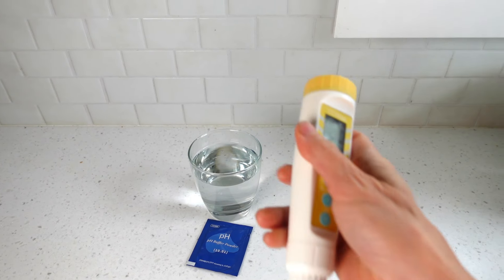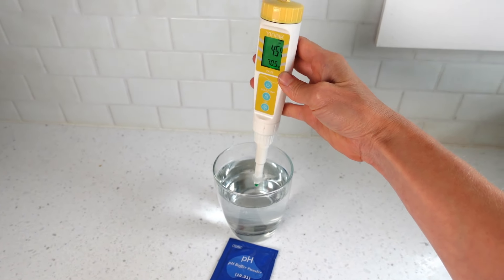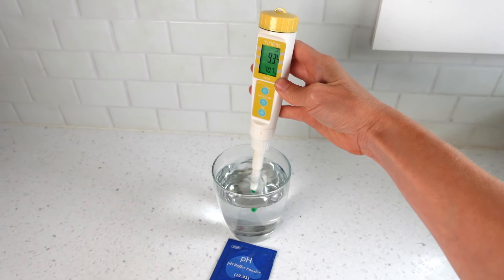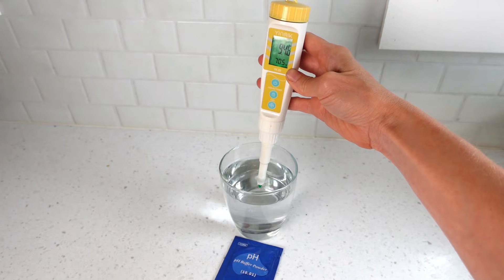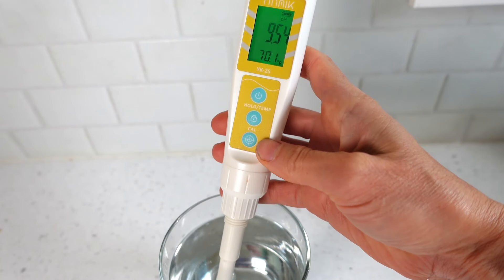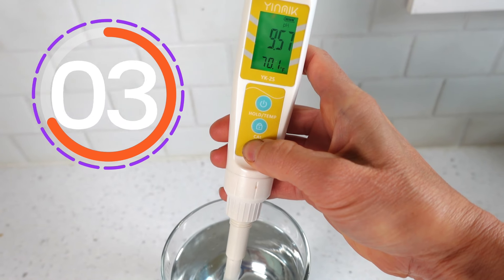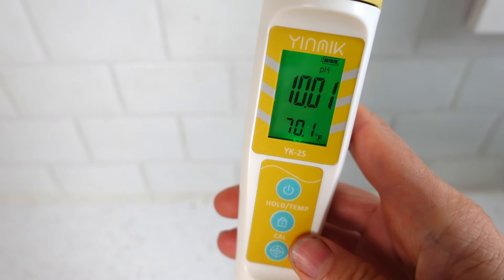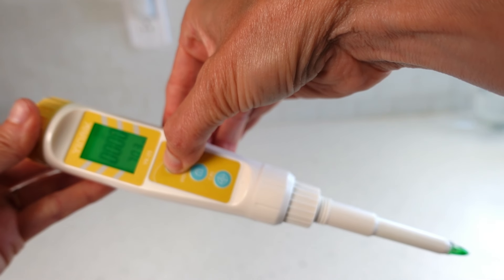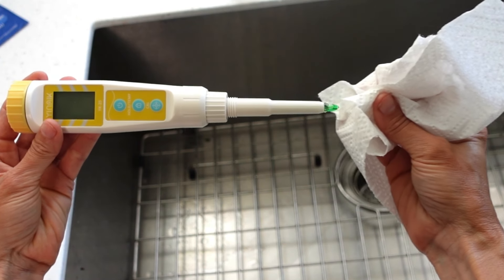Lastly, calibrate the blue 10.01 solution. Turn the meter on, place it in the solution and give it a swirl for a few seconds. Hold the meter still until the pH stabilizes. Press and hold the calibration button for five seconds, then release. The display flashes, then complete. Power off, rinse, and dry. The meter is now ready for use with accuracy.